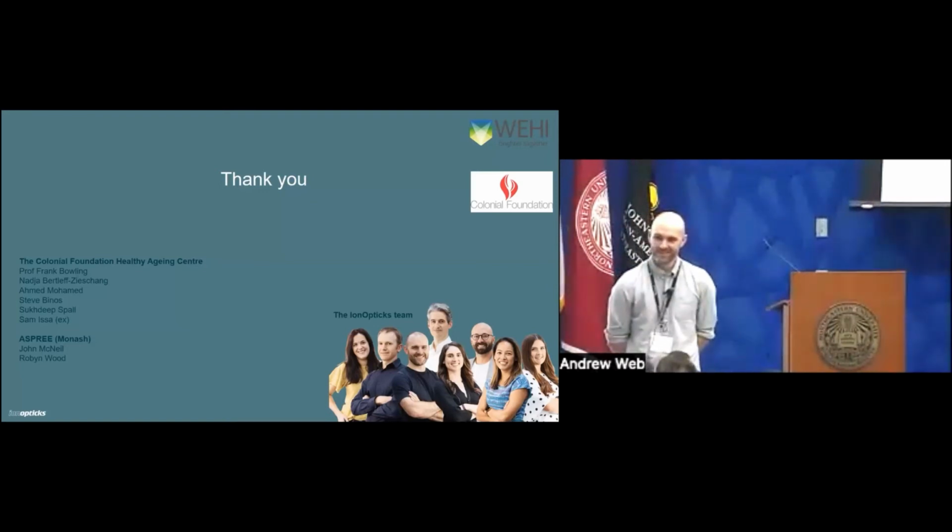Thank you for your presentation. You talk about the need of improving LC separation. And I saw you were working on the timsTOF Pro. Now with the timsTOF, we have ion mobility, which is also a dimension of separation. Do you think the LC improvement is still as needed as before now we have the ion mobility, or do you think it's also a good way to compensate a little bit for the lack of LC separation you are expecting right now?